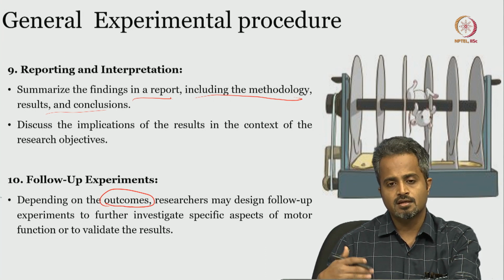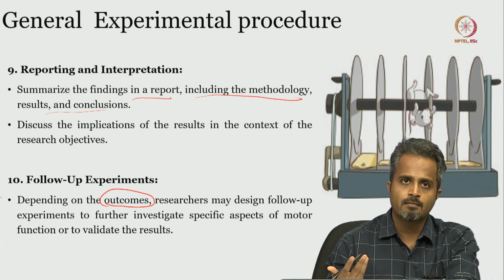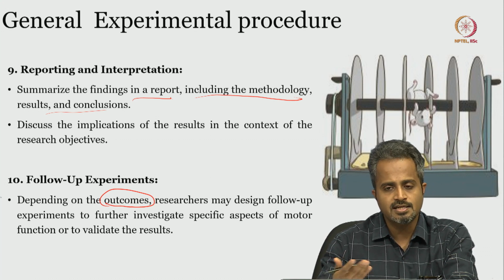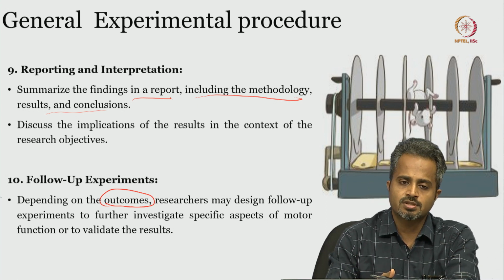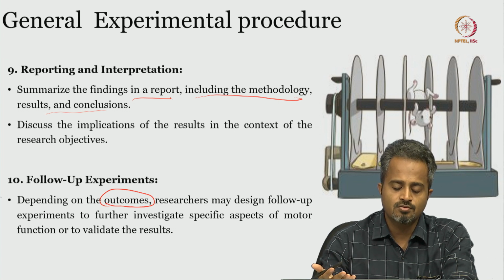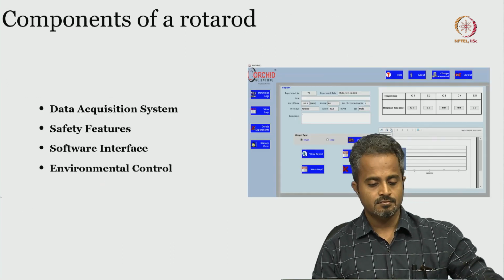Maybe you can have another open field test or cylindrical test or even the swimming test, or maybe multiple tests like the staircase test, which will evaluate the forelimb function. So you can add on multiple other experiments along with this which are synergistic. One would check the gait and posture, another test will test the forelimb functions. So you can have multiple other experiments to follow it through to make sure that all the cardinal manifestations of Parkinsonism are covered. Alright.